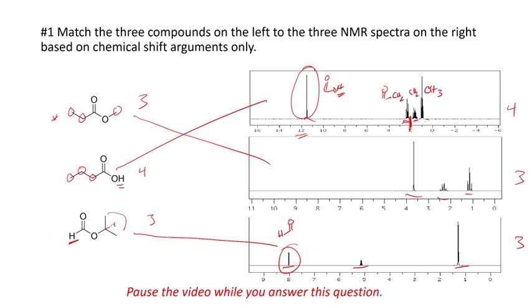Now, if we want to take the opportunity here to learn a little bit more, let's just check these spectra and see what we find. Okay, in the top case, we have 3 hydrogens. Well, which are they? You have this CH3 out here, which is in the alkane region because it's just attached to another CH2. So that's our CH3. And then right around 2, next to the carbonyl group, right? We have a CH2.